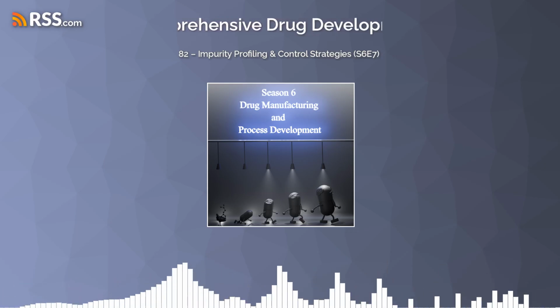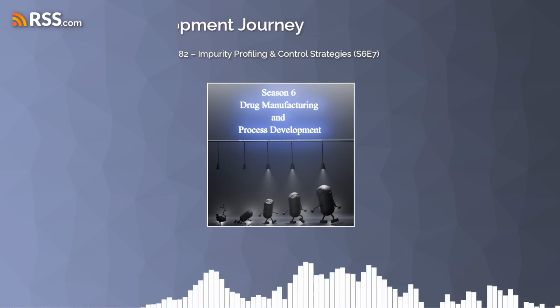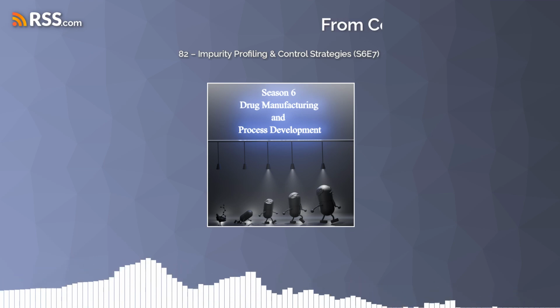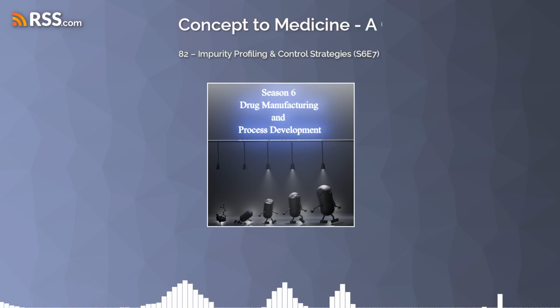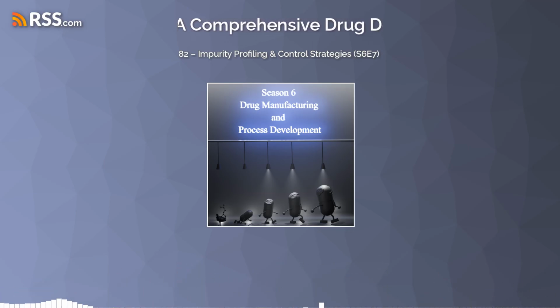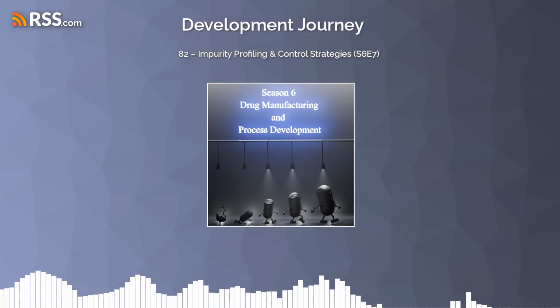Exactly. And sometimes only one of those forms is the actual medicine, the effective one. The other one could be totally useless, or even worse, cause problems. Could even be harmful. So HPLC can tell them apart. That's why it's so powerful in this context, that ability to do such specific separation. So crucial. Makes you realize it's not just about what's there, it's about the specific version of it too.